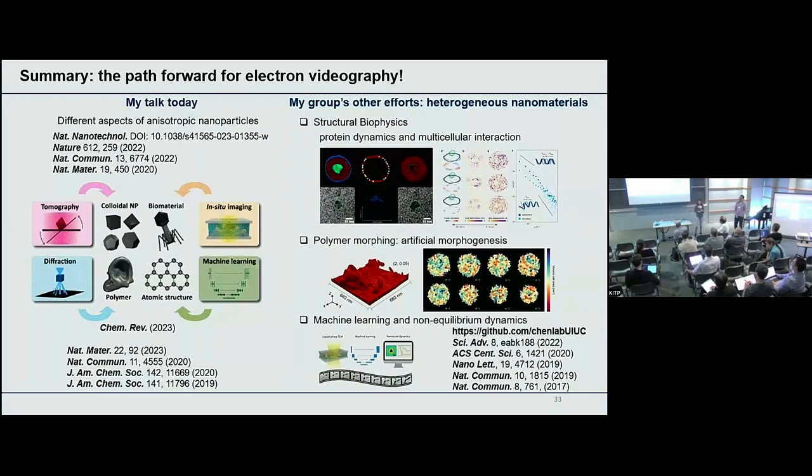Right. So in terms of thickness, that actually depends on what you want. For example, if you're dealing with a polymer or protein sample, because the intrinsic contrast is already very low, for those kinds of imaging, you want to make sure the liquid is pretty thin. Otherwise, you contribute a lot of background noise. So for those cases, we will use the graphene liquid pockets, and that can give you about tens of nanometers to hundreds of nanometers liquid thickness.